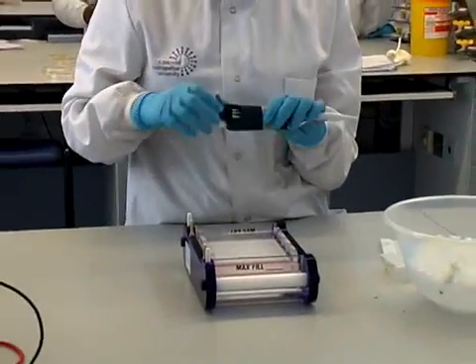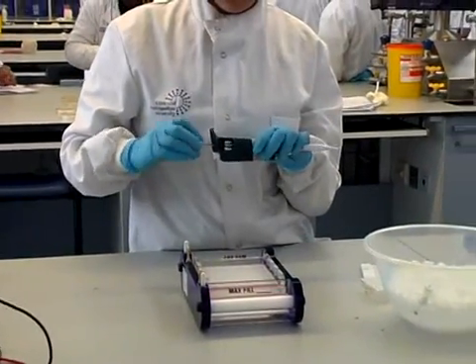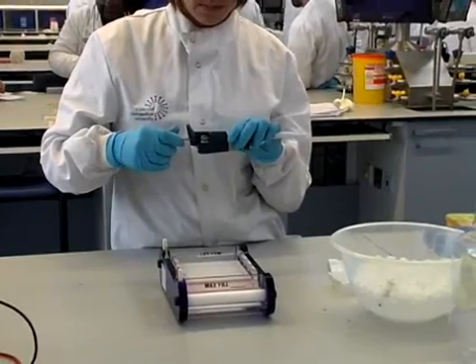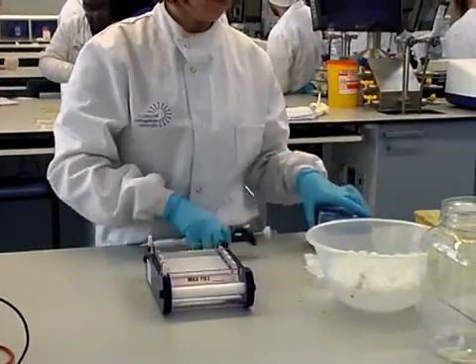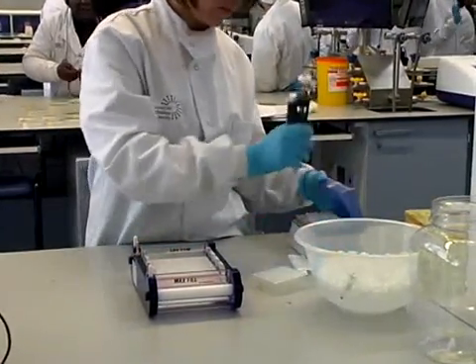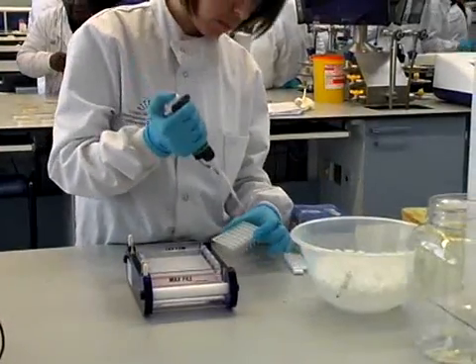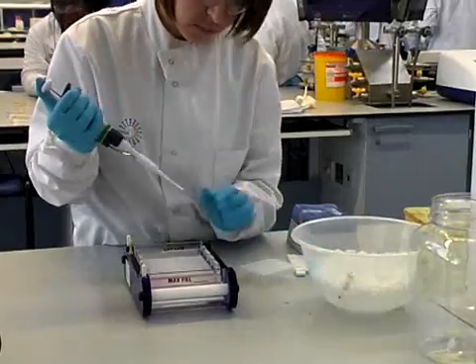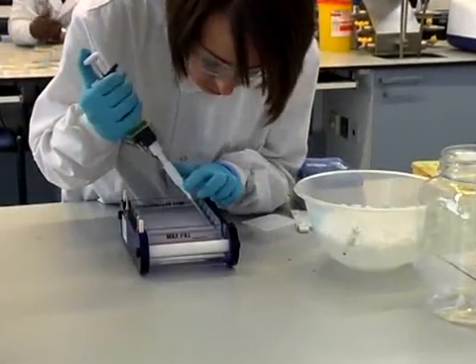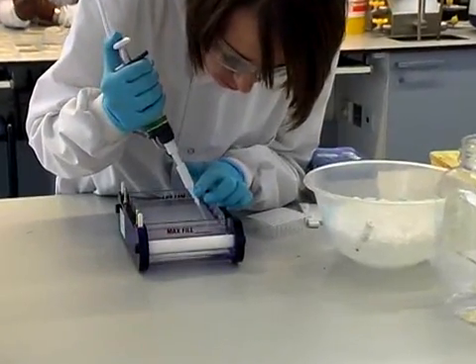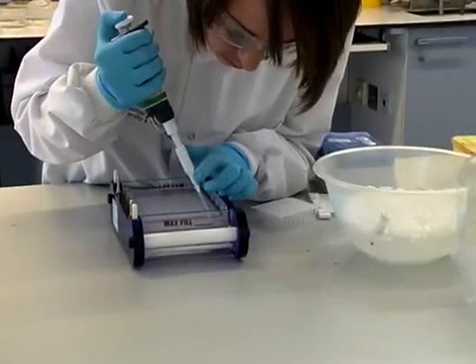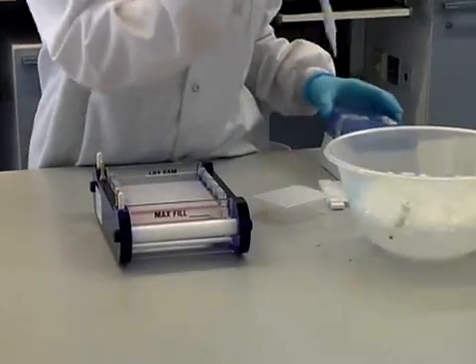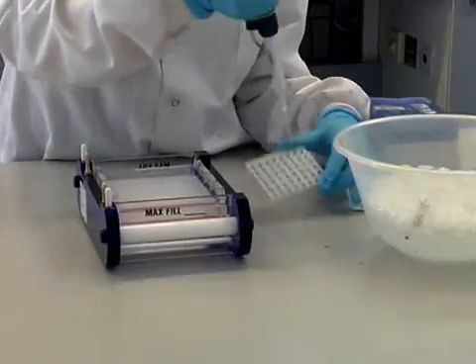The gel is now ready to have the samples added so the pipette is set to the correct volume for each sample. A fresh tip is used for each sample. The first sample is taken and carefully dispensed into the well. Care should be taken not to put the tip through the bottom of the gel when adding your sample.